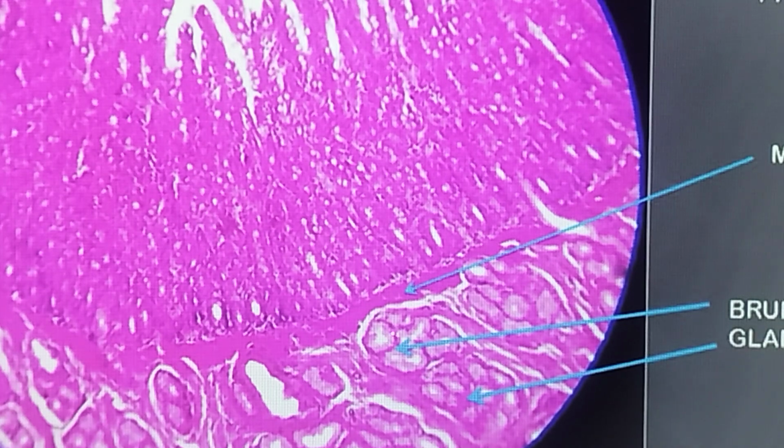Look at the mucus acini. They are typical empty looking cells or lightly stained, and the nuclei are peripherally arranged and flattened. These are mucus acini we have discussed in the earlier video. So we can see a lot of mucus acini here.